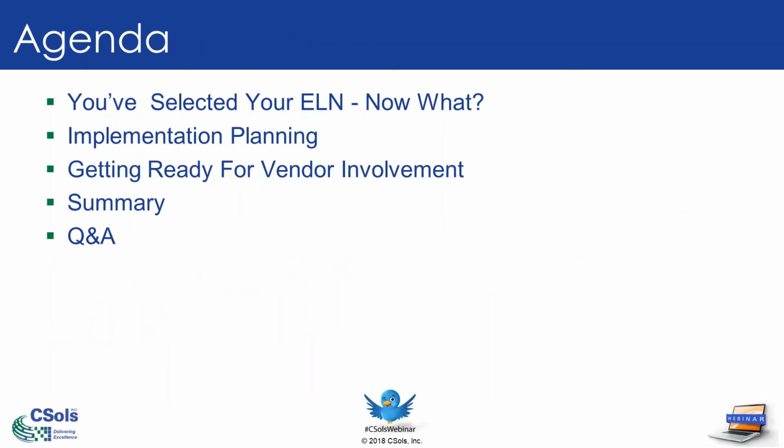Well, here's the agenda, and the premise of this webinar is that you've already selected your ELN. As you're probably aware, there are many ways of selecting your ELN. So we're going to describe those different ways and where they position you for implementation, based upon how your selection has been made.